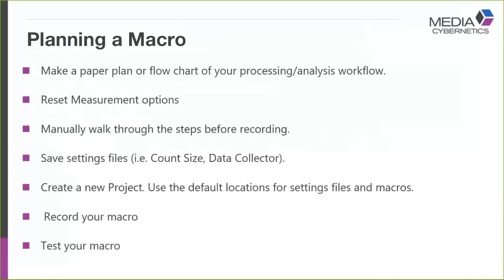So starting off, planning. This will save you a lot of time and effort. Make a plan. Scratch paper, whatever, Word document, notepad, but write down the steps that you want to do. This will simplify your life a lot. It also gets logic down as you're walking through about what you want to do.